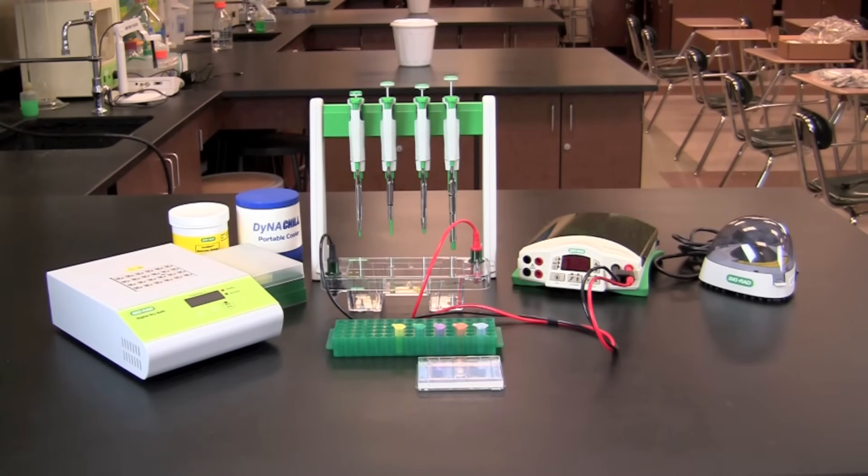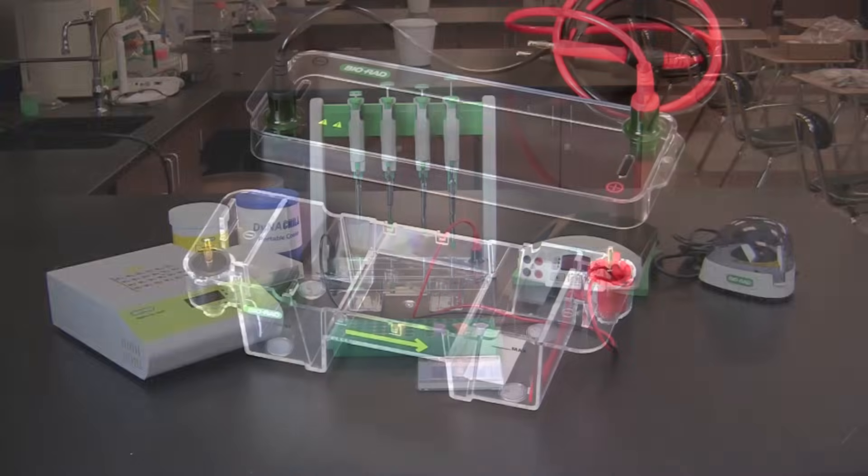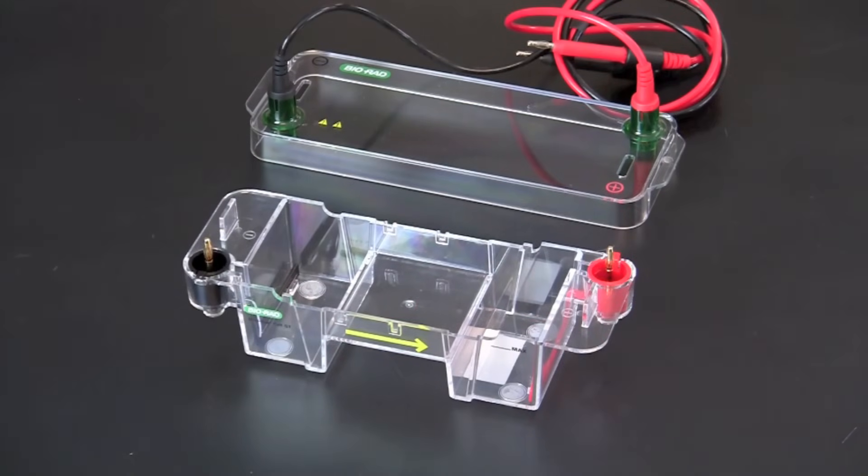This video will take you through the process for loading and running DNA samples on an agarose gel. You will be using a mini subcell to perform agarose gel electrophoresis. The subcell has an electrode wire running across the bottom of each end. This provides for an electric current to pass which separates the DNA fragments in the samples.